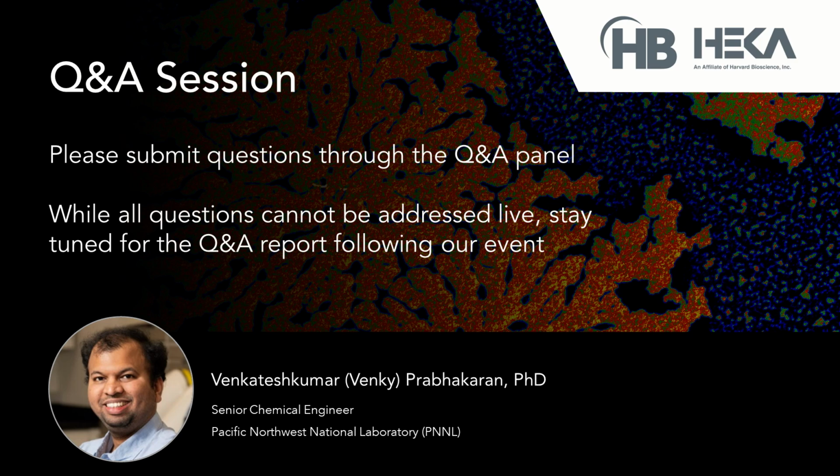Excellent. All right, next one. This person says, "Hey, Venky, wonderful talk. Thank you. Just two questions. Can you explain what is SECCM bulk? And also, can you explain a little bit of why the impedance data does not correlate well with the surface microstructures?"